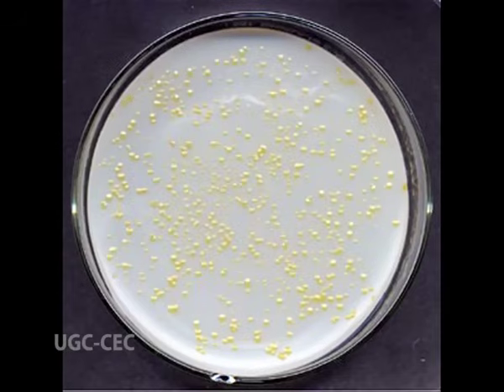Bacterial colony refers to the population of cells which has developed from a single bacterial cell. So, what is a colony? It is basically a clone of cells. That means all the cells in a bacterial colony are of the same type, or they belong to the same species. So, if we want to see the growth of microbial cells which are so minute, we look at their colony growth. We call it population study. Not a single cell is looked at, but we look at the population of the bacterial cells.